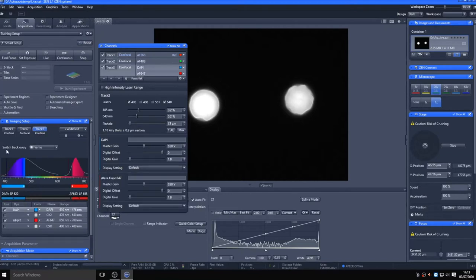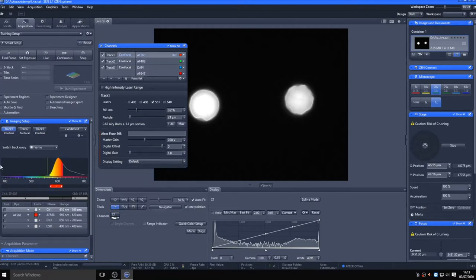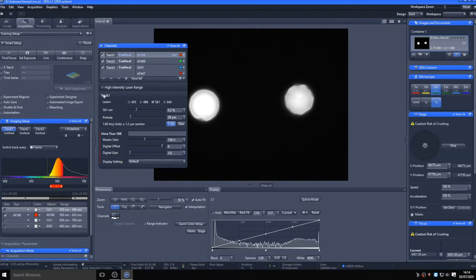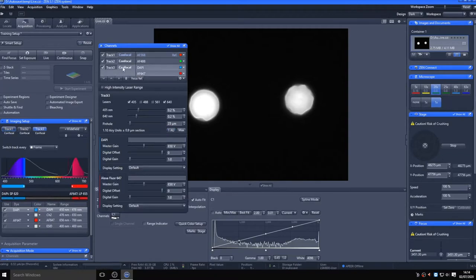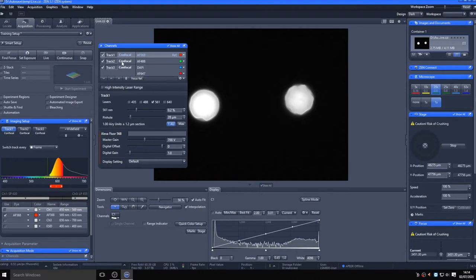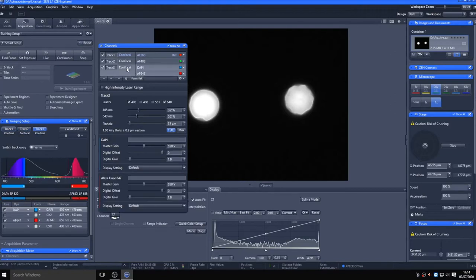However, the imaging of Alexa 488 on track two is set to use the first GaAsP detector, which can only be modified from the long wavelength side, which means you are collecting emitted fluorescence from 410 to 567 nanometers. If this was a real sample containing conjugated antibodies and DAPI rather than autofluorescent pollen grains, there is a possibility that the 488 excitation for this channel would pick up any autofluorescence in your sample, along with any potentially photoconverted DAPI.